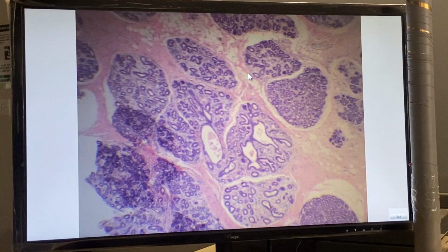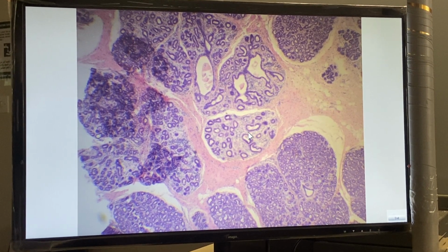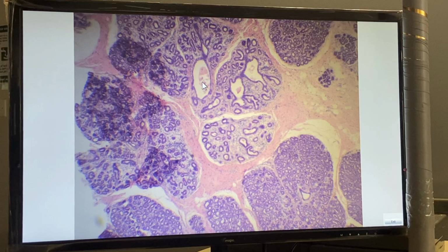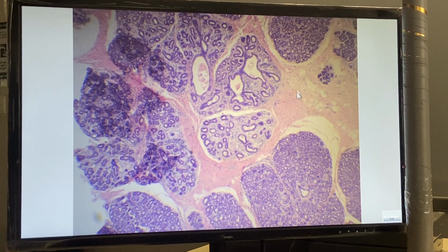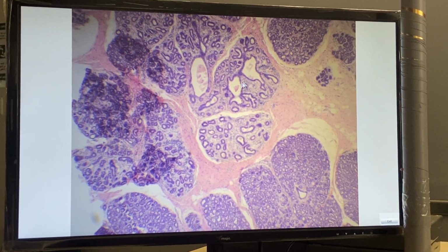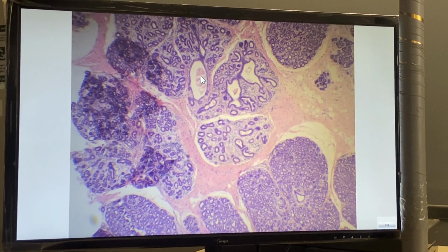Second phase or second slide, section in mammary gland during pregnancy. Both the alveoli and ducts are dilated by the accumulation of colostrum. The connective tissue is reduced in this phase. Alveoli, duct filled with colostrum. Colostrum is a fluid rich in proteins and leukocytes.